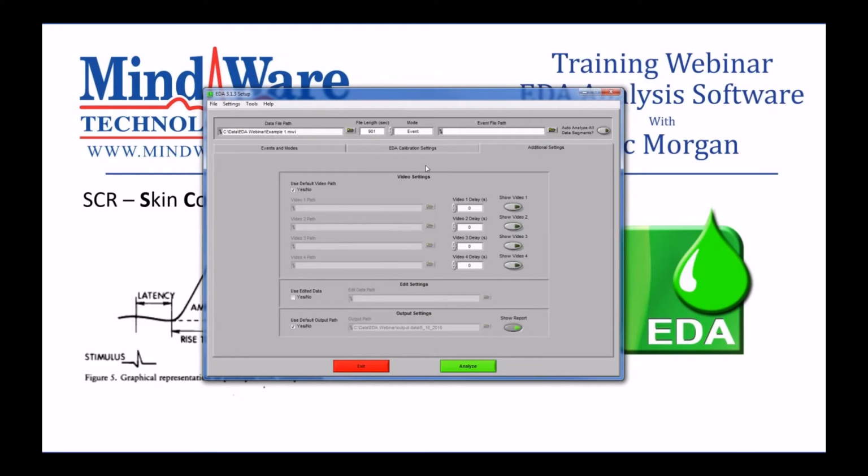Finally, we have our additional settings tab. Again, something I'm not going to touch on too much because it's sort of generic for all of the analysis applications that we have. But here's where you would map your videos if you had recorded videos along with your physiology. It's where you'll map your edit file, which we're definitely going to talk about later.